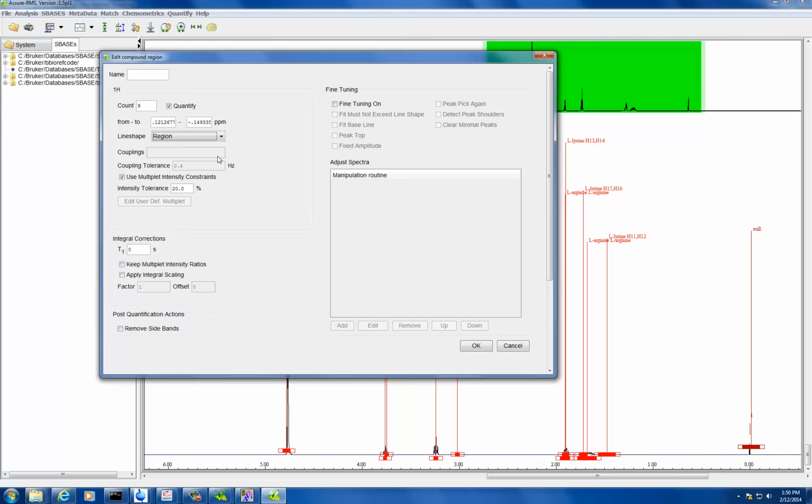Because when you analyze complex mixtures, something that's equivalent like this, fine. But if it's like this, how do you know that is one compound? Because technically, if it's the same here, there's this leftover residual that could be another compound there. So usually you give a tolerance in what you think that it should be. That is fine, since it's just a singlet. And then all these other things here, I don't think you would need to use as much, the fine-tuning for now. So we're just not going to focus on it. And then just click OK.